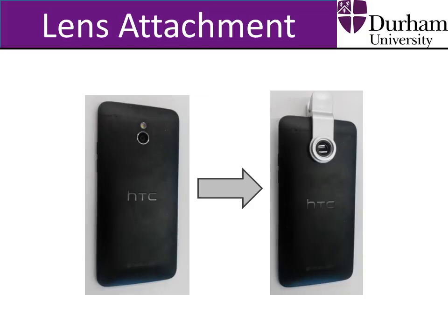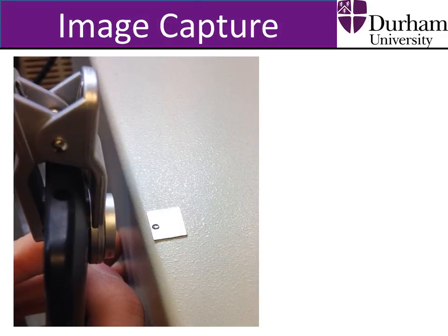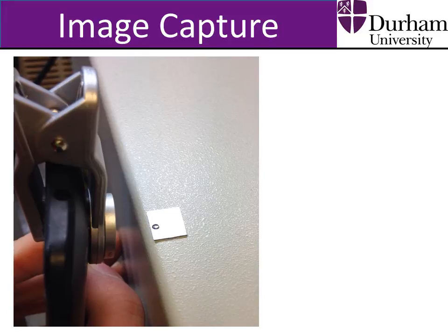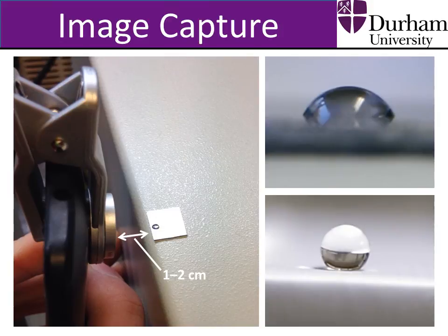The lens attachment is then simply clipped over the camera lens of the smartphone. It is useful to have the smartphone camera on to ensure the lens attachment is properly aligned over the centre of the smartphone camera lens. Position your sample flush with the edge of a workbench or table in a well lit environment, preferably in front of a white wall or white backdrop. Using the pipette, dispense a small droplet of water close to the front edge of the sample, i.e. the edge that is aligned with the edge of the workbench. This is to enable the smartphone, with the lens attachment, to be positioned close enough to the sample to focus on the droplet. Position the smartphone approximately 1-2cm from the droplet, and use the smartphone camera's in-built zoom and its autofocus to achieve the optimum resolution close-up image of the droplet. The zoom is best used to approximately halfway, and the autofocus used by tapping on the image of the droplet to focus the smartphone's camera on that droplet.